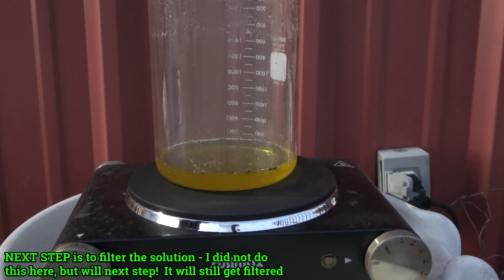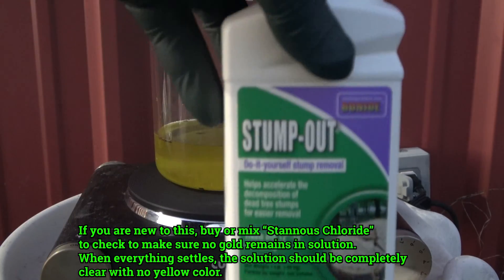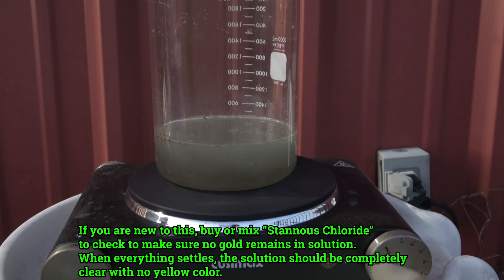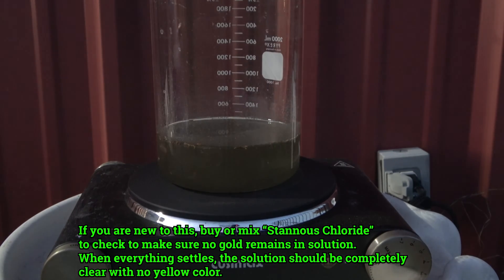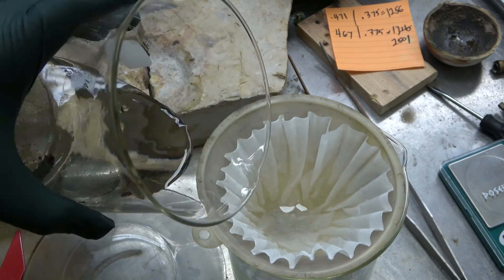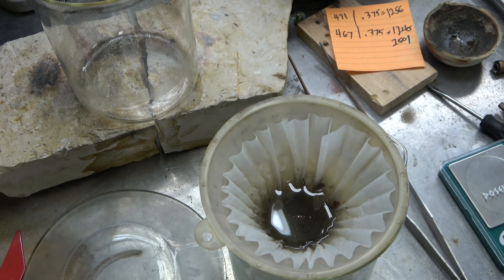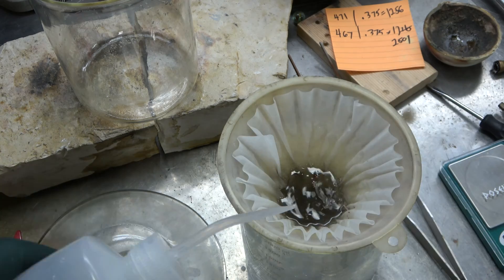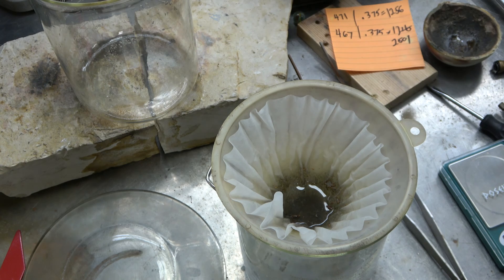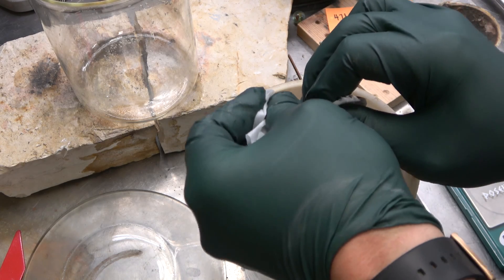Normally you would filter that solution, but I got sidetracked and it didn't go as planned. I added distilled water to dilute it a little bit, then used stump out - which is sodium metabisulfite - and that brings the gold out of solution. If you're new to this process, you'll want to use stannous chloride to make sure no gold remains in solution. So this is the gold plus impurities from that solution. Since this isn't how you'd normally do it, I'm going to do the process again - put it back in solution, filter it properly, then bring the gold out of solution using sodium metabisulfite.